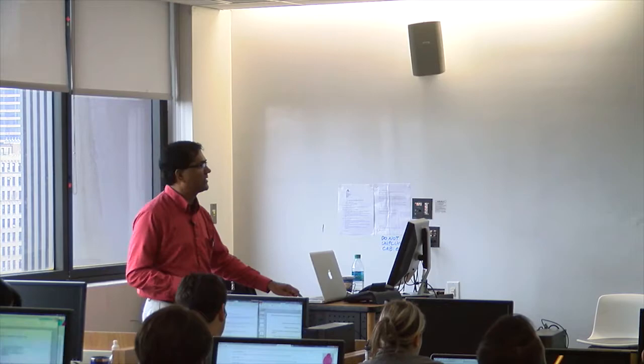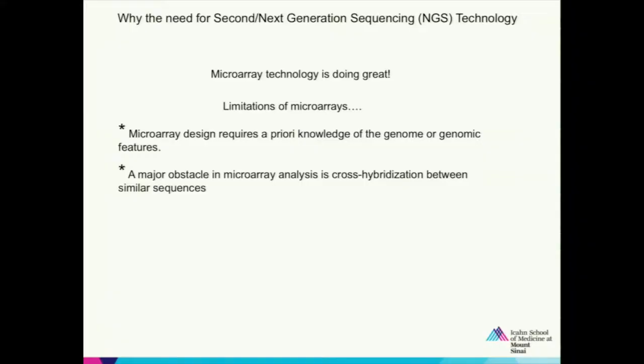Next, a major obstacle is the cross-hybridization between similar sequences. It's a hybridization technology, right? And then if the sequences are similar, there could be cross-hybridization. That is a very severe limitation with microarray. So washing conditions are very important. It all depends on the person, graduate student or postdoc or technician, who is washing these arrays. So technician to technician, it will vary.